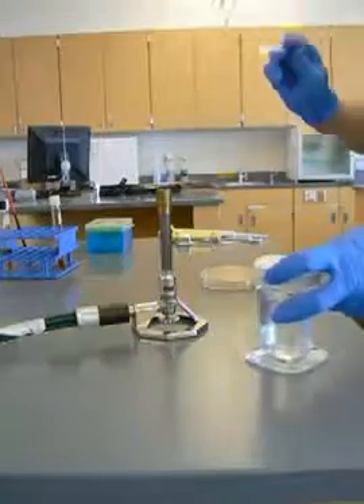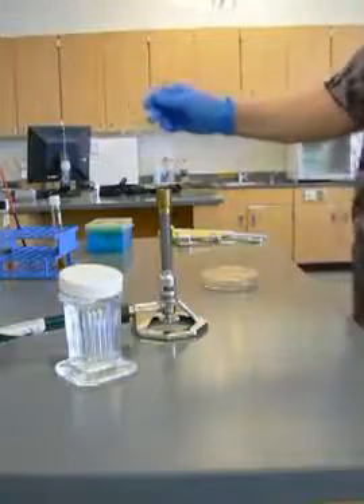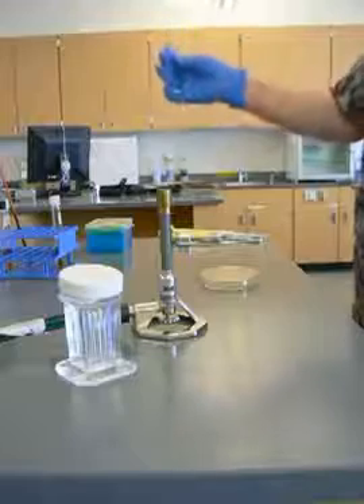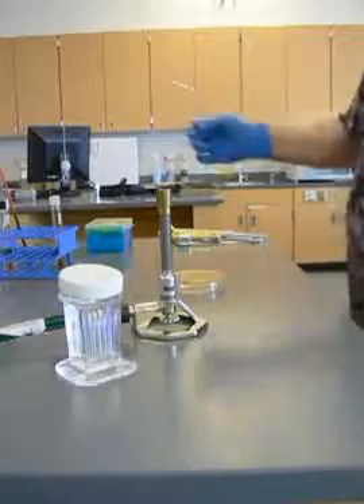Before I put this down, I'm going to flame my hockey stick again. You can see the flame has been all over where I've had bacteria — now it's sterile. Once this has sat for long enough, we're going to flip it over so it can incubate upside down.